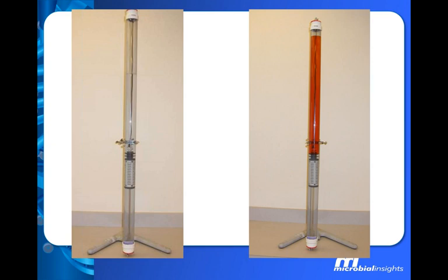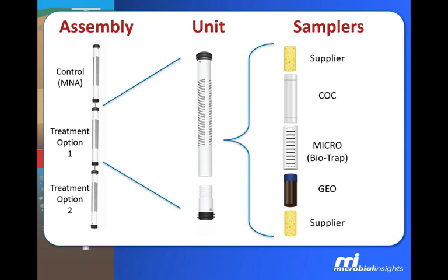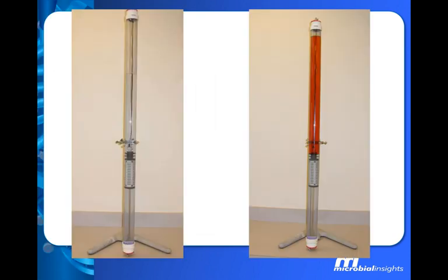Here is just a little dye test to illustrate the way these in situ microcosms are isolated from each other. If you look at that previous slide, you can see the baffles on the end of each one of these units to make sure that they are hydraulically isolated from each other in the groundwater monitoring well.